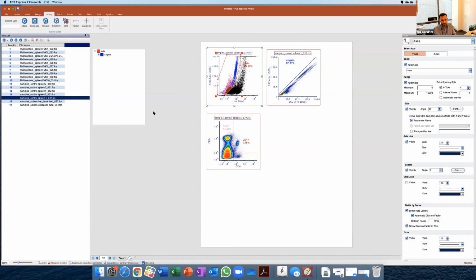Everything coming up to the acquisition, and even sometimes during acquisition, that wasn't consistent or wasn't done correctly, right? And then, of course, you run into problems like Kathy was saying. If you don't titrate your antibodies well, you're not going to have very good resolution. And for instance, you may end up with something like this. And you don't know then if this is something to expect biologically, or if it's just an artifact of bad sample prep, right? Exactly.